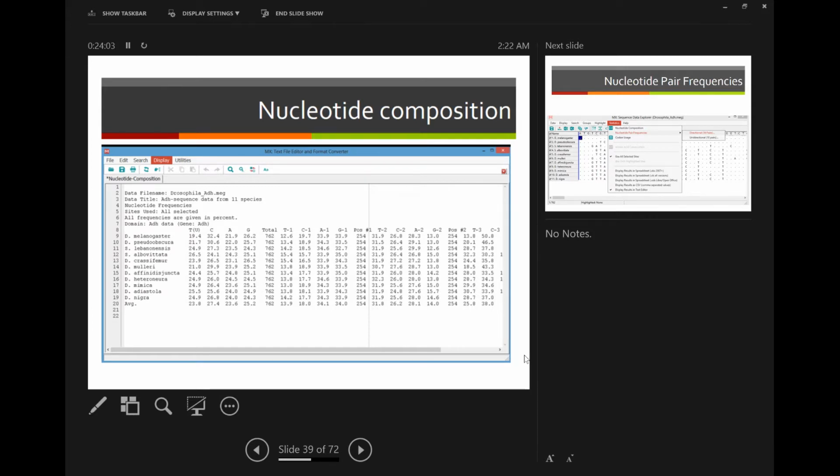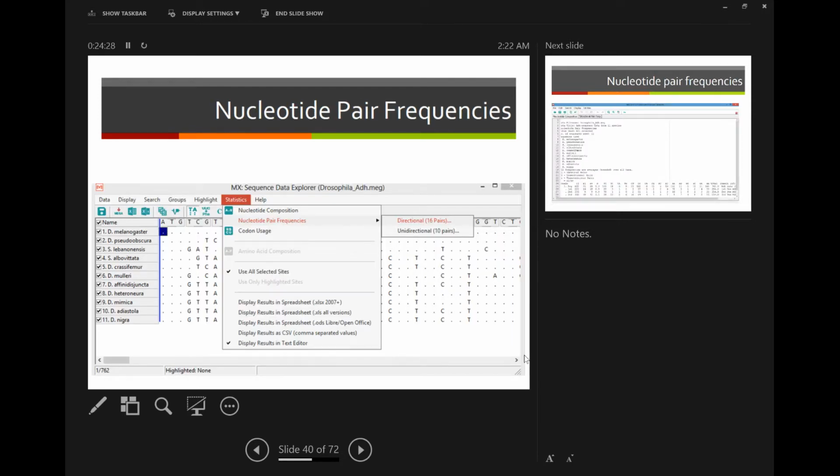You should notice that the 3rd codon positions are the ones that vary most, so you have to be more careful about this one. And you can use this to select a proper model, so that if these numbers vary a lot, you should select an evolution model that would take into account the different base compositions.